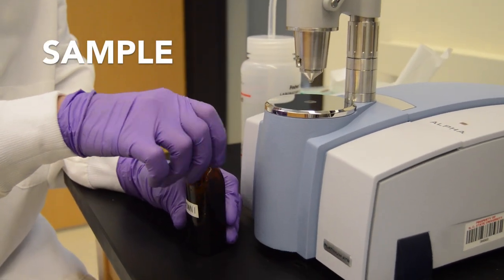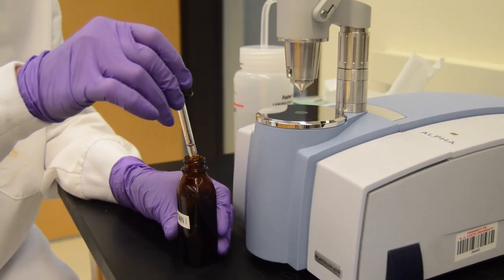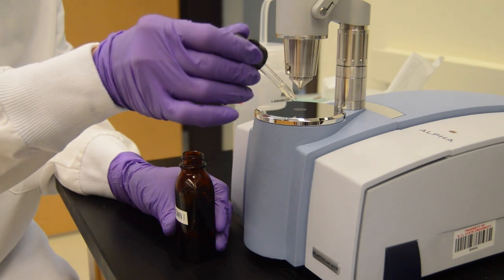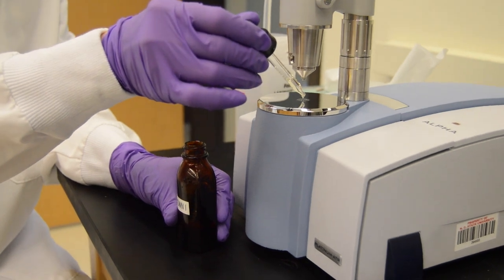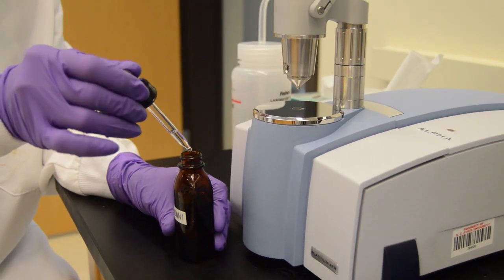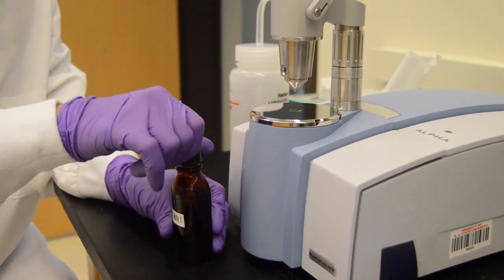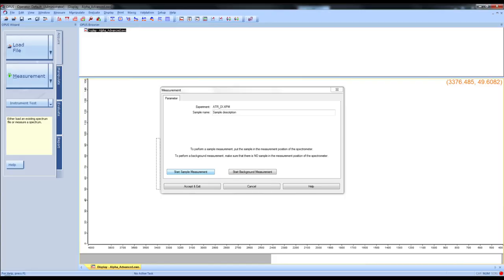To load the sample, place one drop on the window. Always remember to wear gloves. Now you can click start sample measurement.